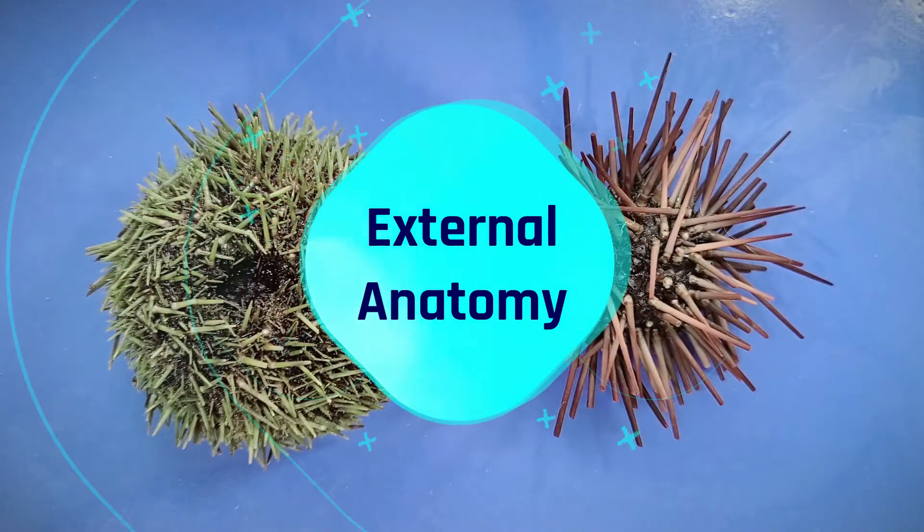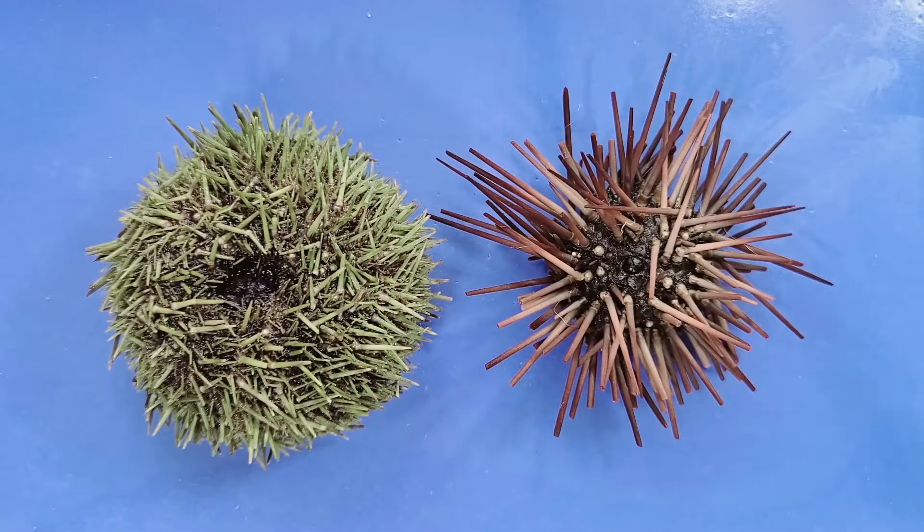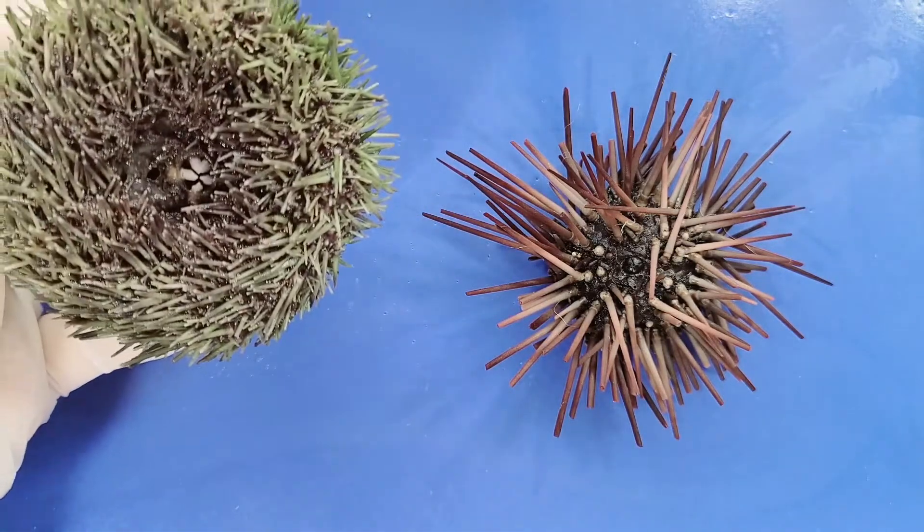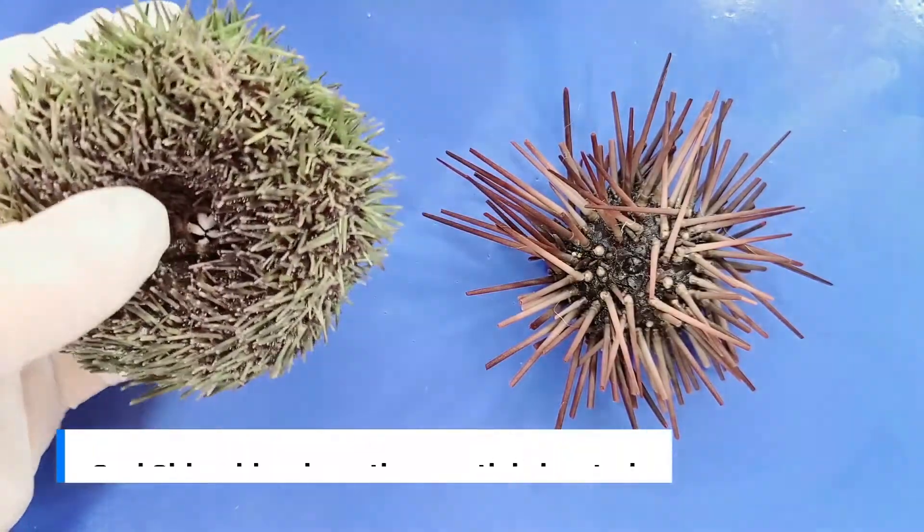Let's look at the external anatomy. This side, where the anus is located, is called the aboral side, while this side, where the mouth is located, is called the oral side.